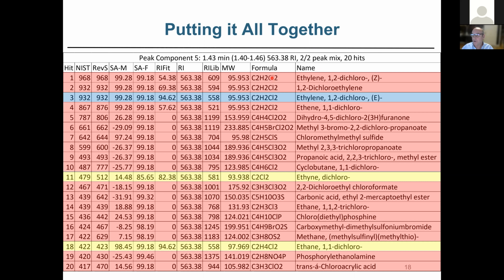So that says, okay, that formula is correct. So we have another thing that validates that particular compound. We can also look at the fragments. They're not so important at this level, but if you start to look at compounds that aren't in the library, it becomes a more important metric that you want to dig into and look at a little deeper.